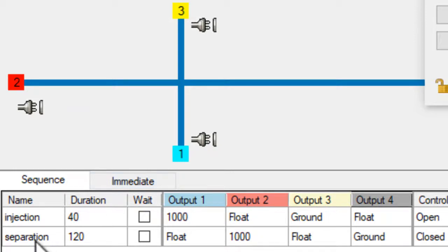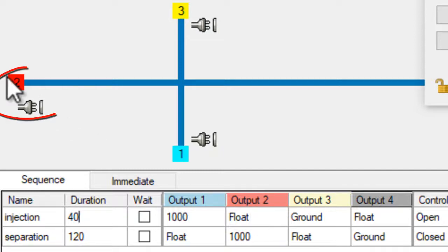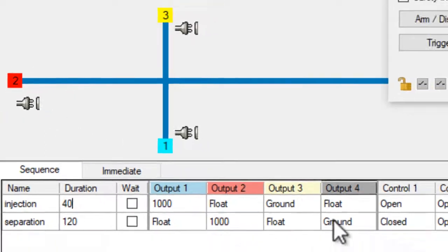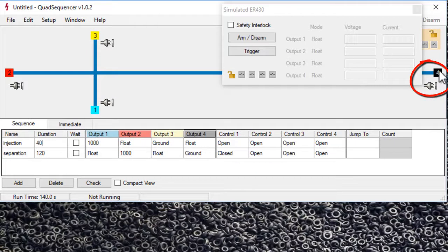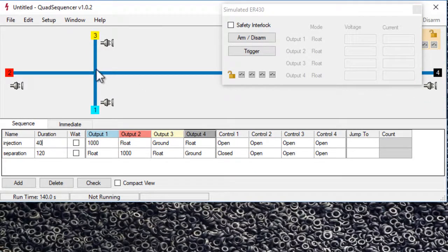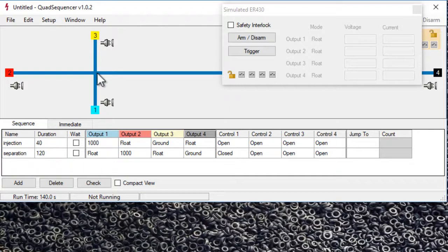We have a separation step which lasts 120 seconds. It's now going to apply a thousand volts to output two here and ground to output four over here, which is going to push our little plug of sample which will be in this junction. It's going to push it towards reservoir four whilst doing the separation.